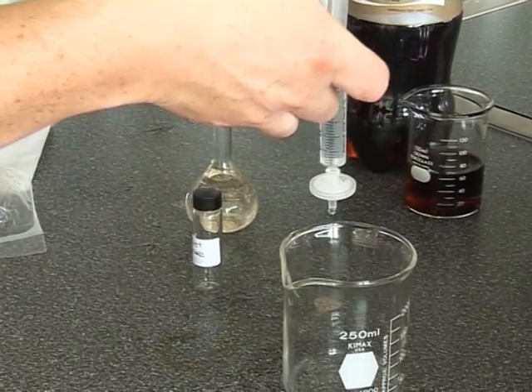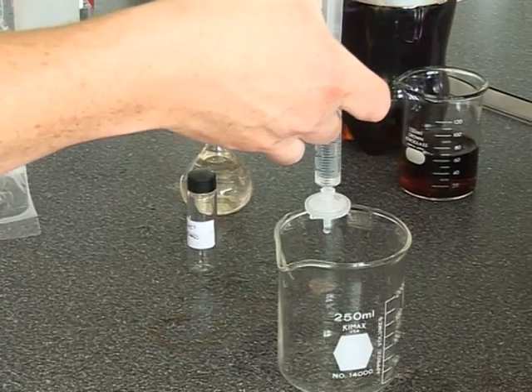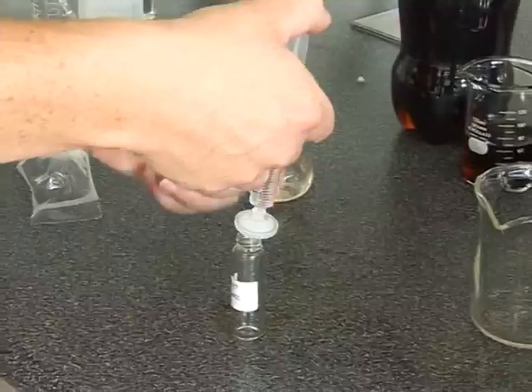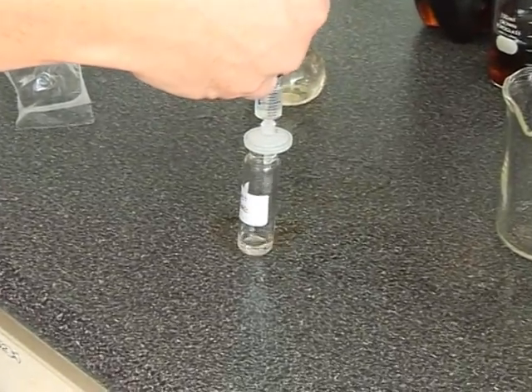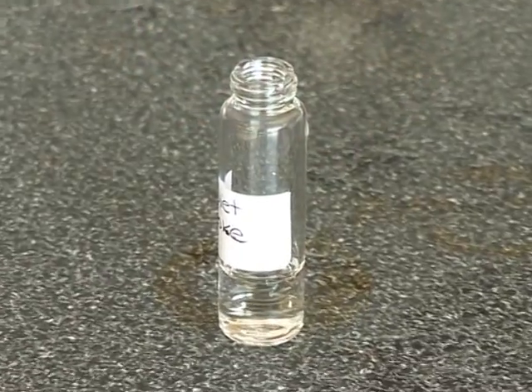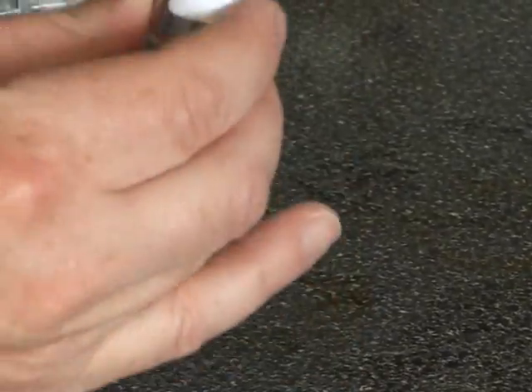Discard the first few mils of the eluent and then collect the rest of the eluent in a sample bottle. Make sure you label the bottles with the corresponding sample. The standard solutions and the samples are now ready to be analysed on the HPLC.